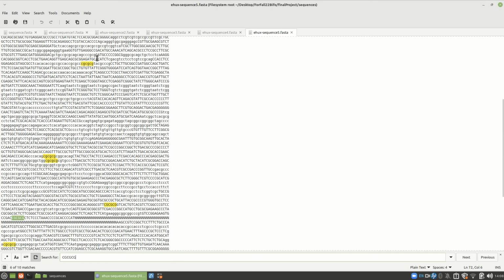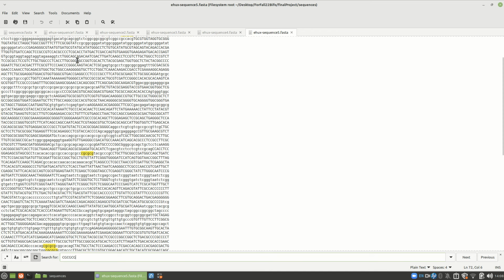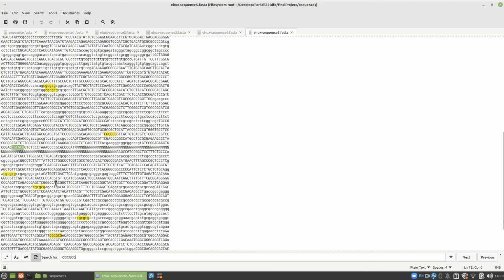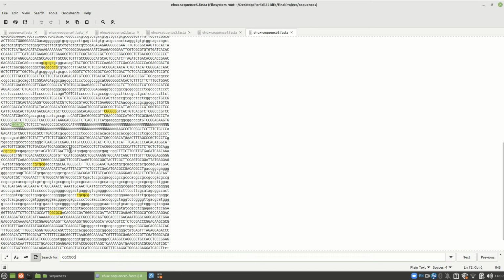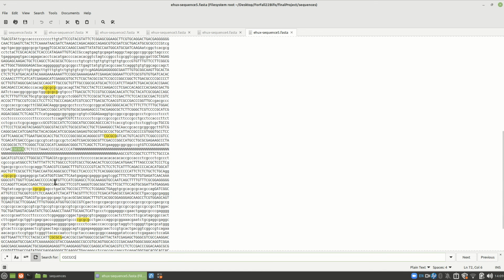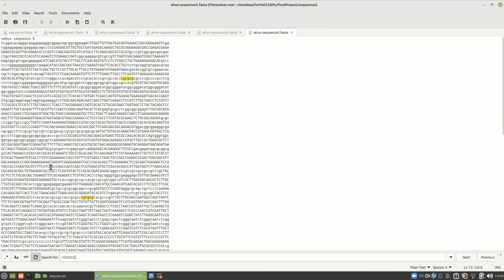But when we get to just these, it looks pretty clear that it's either here, even though those are not good. But this looks a little better. These are clear-cut CGs that are sequenced well, they're saying. So I'm thinking this region, if we agree with those, then this region is your CpG island, and maybe your first exon is down in here. And then this looks like maybe there are no CGs. This might be the later part of your gene. I would definitely go with that first.